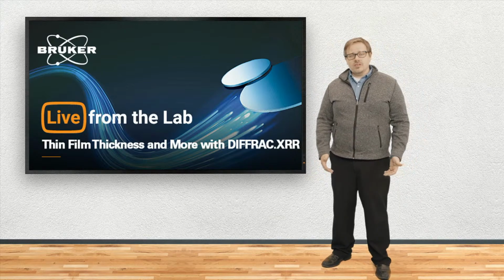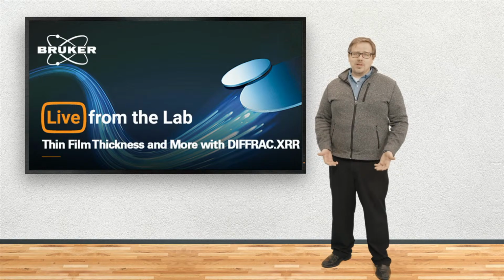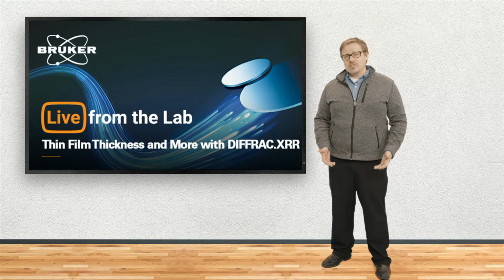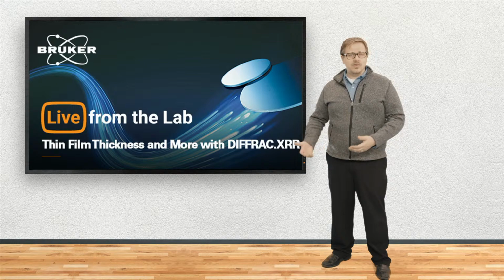This is the show where we talk about different technologies that Bruker has developed to help scientists understand the world around us. Today's topic, X-ray reflectometry. Now, X-ray reflectometry is a technique that's used to measure thin films.